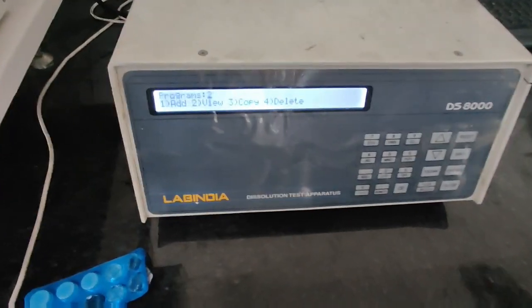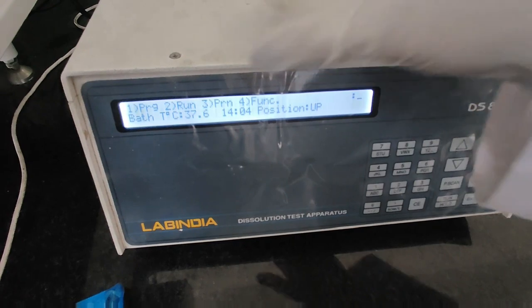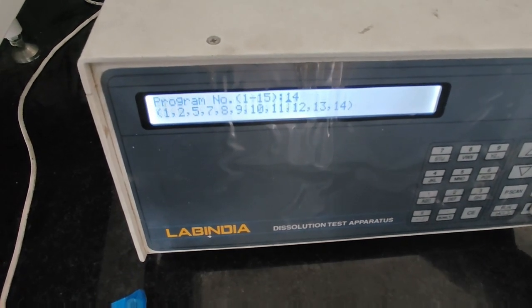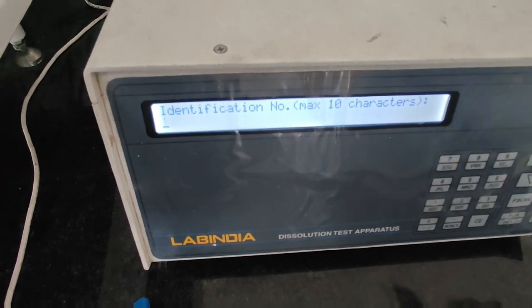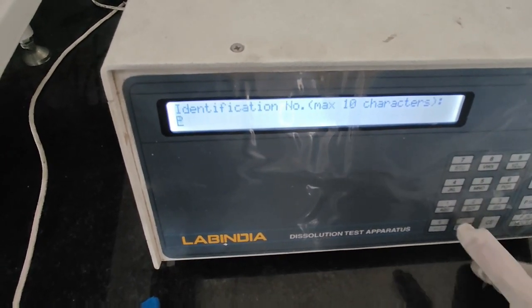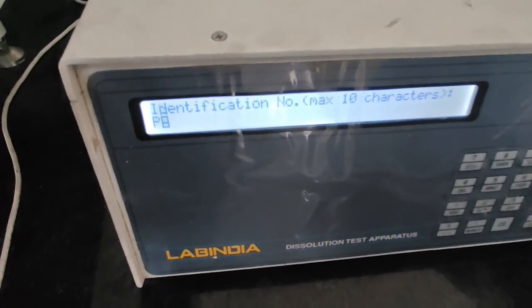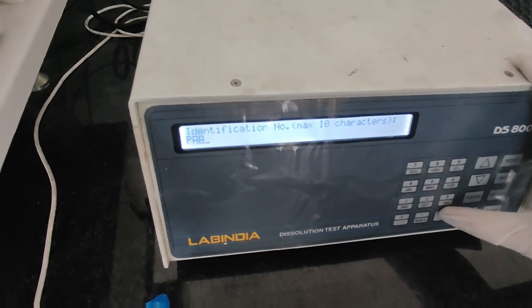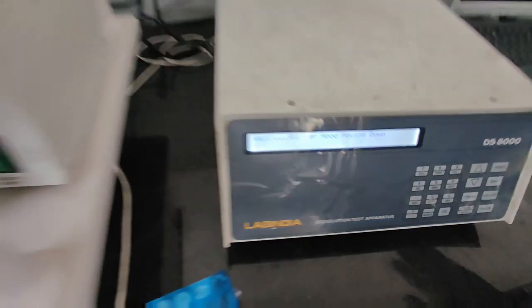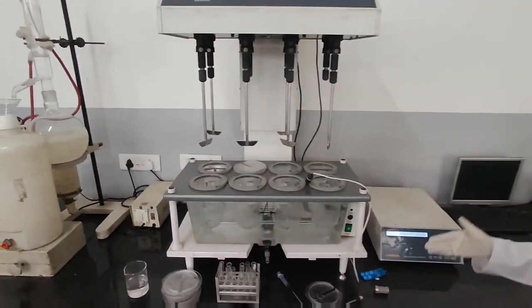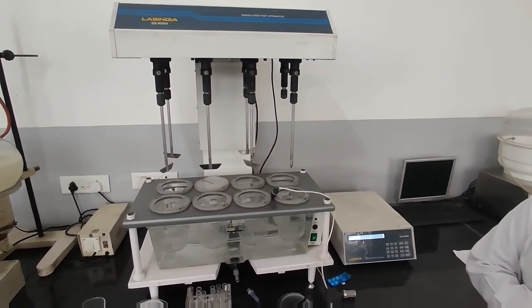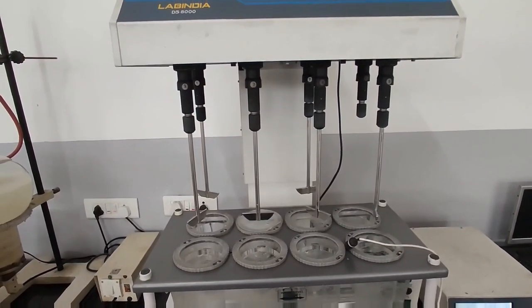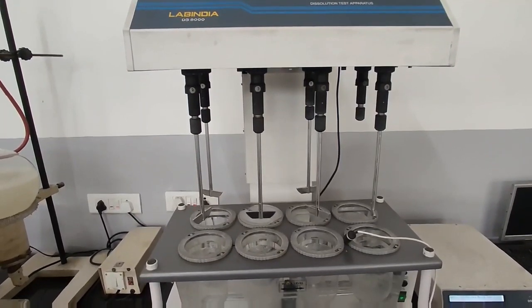Now we are to run the program. For that we will press escape. Select 2. As you can see it is showing run. Then press enter. It is asking the identification number. I have entered PA. Then again press enter. Now as you can see, paddles are going downward till they are reaching to their particular position.